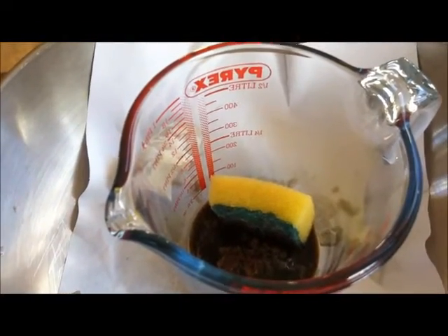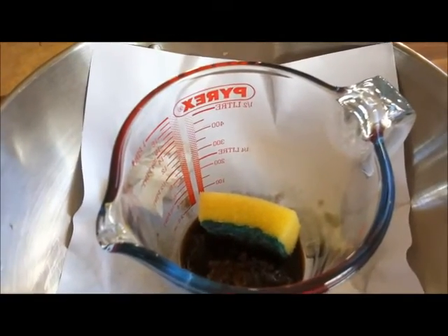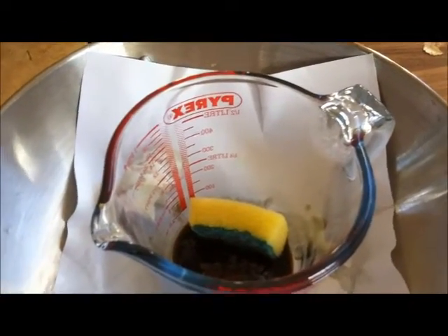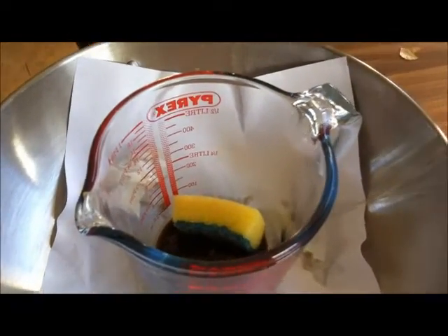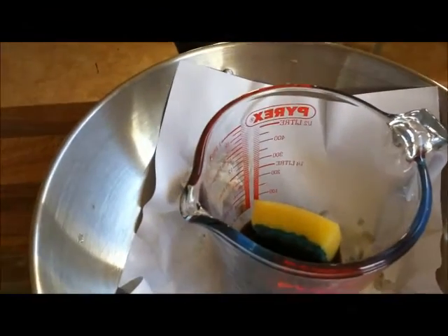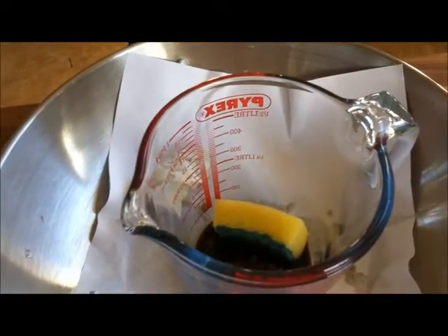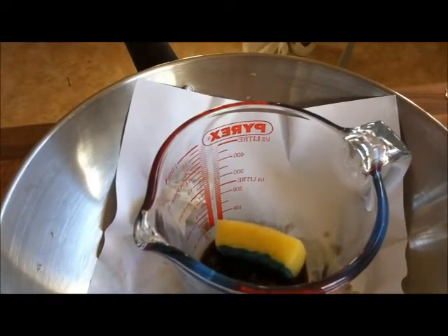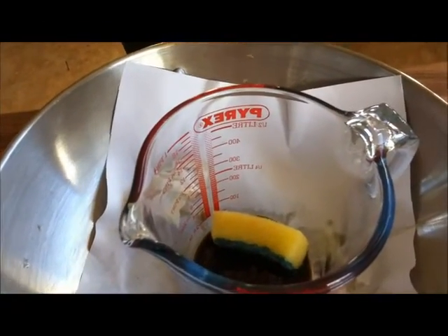So it's very, very dangerous. If you're unfortunate enough to get this stuff on your skin, I would recommend wiping it with a paper towel - try and wipe off as much of the excess acid as soon as you can. Because if you just simply rinse your hand under the tap, the water will actually boil when it comes into contact with the acid and you'll actually end up with a thermal burn as well as a chemical burn.